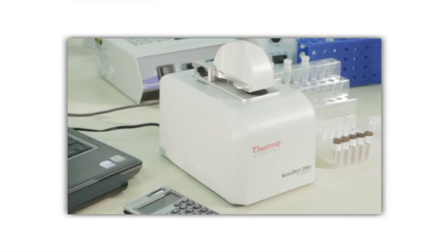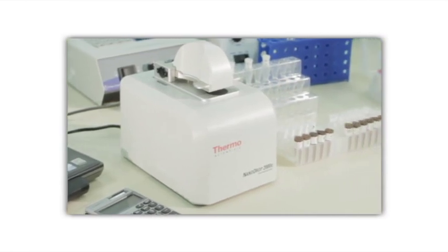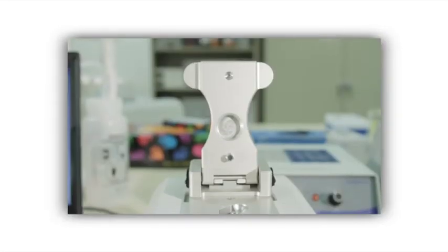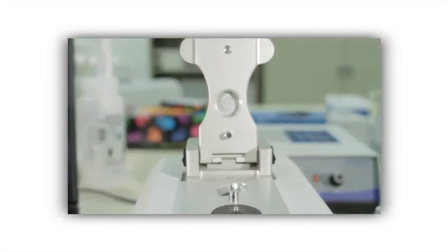The Nanodrop Sample Retention System is innovative technology that uses the inherent surface tension of liquids to hold and measure micro-volume samples between two optical pedestals without the use of cuvettes or capillaries.